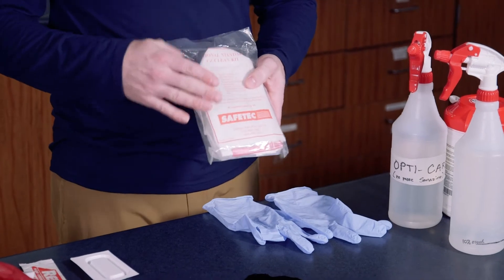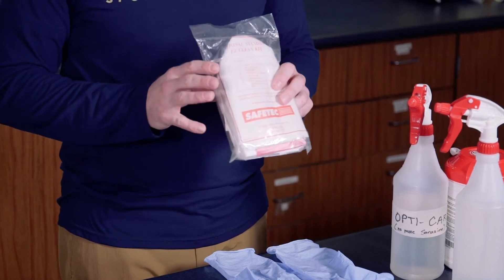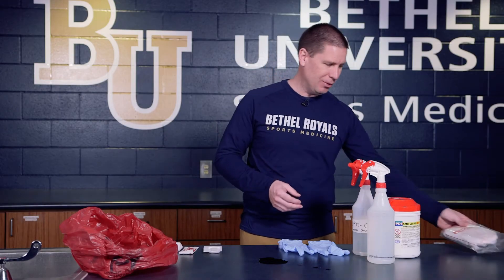Fortunately no one has touched it right now, so it's fairly well contained. We just need to make sure that we clean it up appropriately. There are a number of different pieces of equipment that are helpful. Most of the stuff I have comes self-contained in this little packet, which has gloves, towels, and a whole host of things to clean that particular surface up.